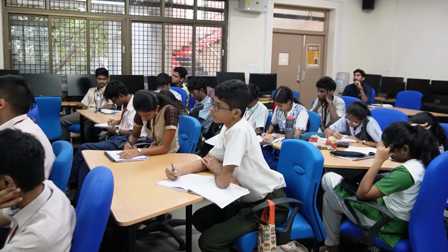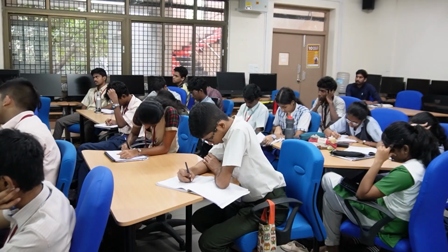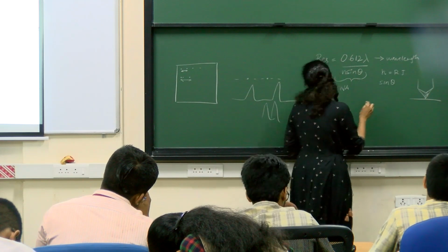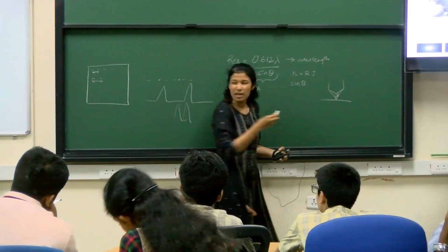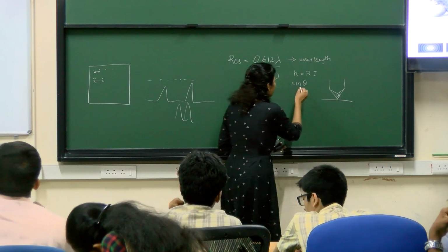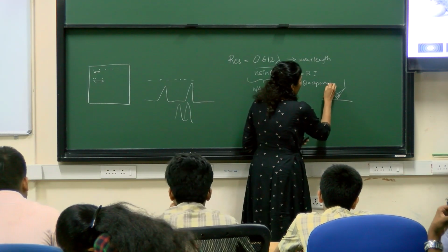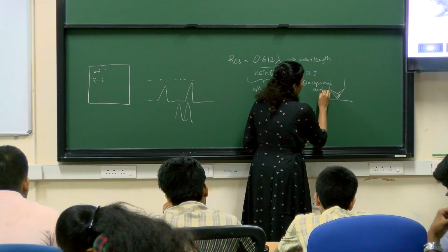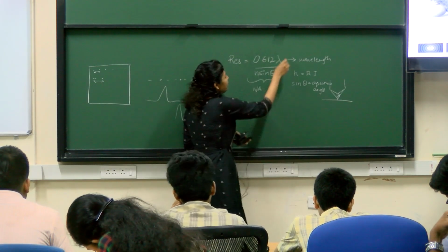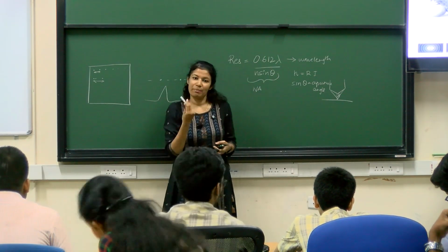If you have the objective and you have your sample, the objective makes an angle with your sample. Half of this is called the aperture angle, and they've used alpha here. I think you can use alpha or theta. So sine of this is the aperture angle. All of this gives you the numerical aperture, and this is what the resolution of your image depends on.